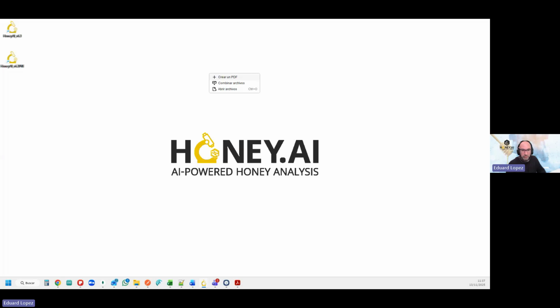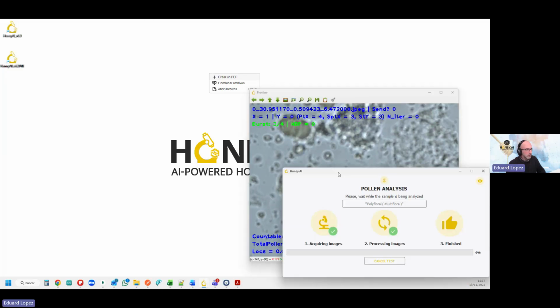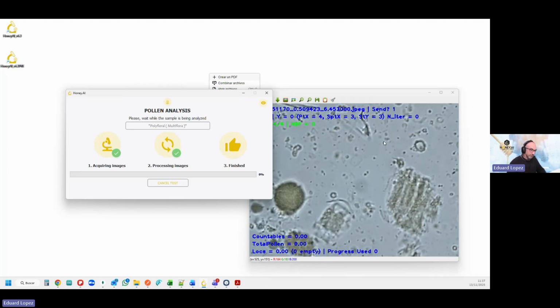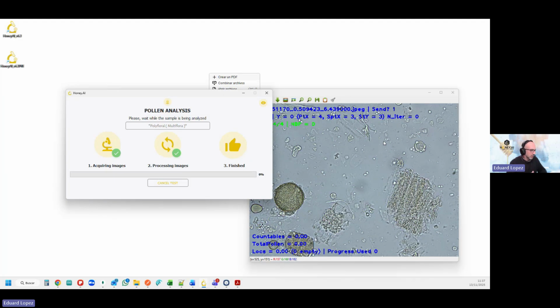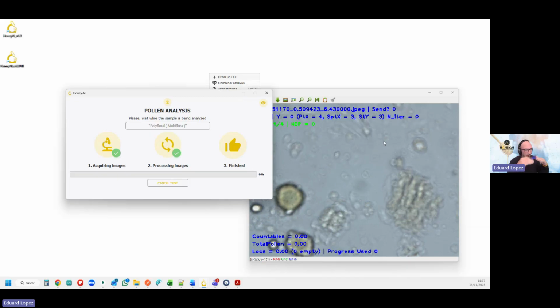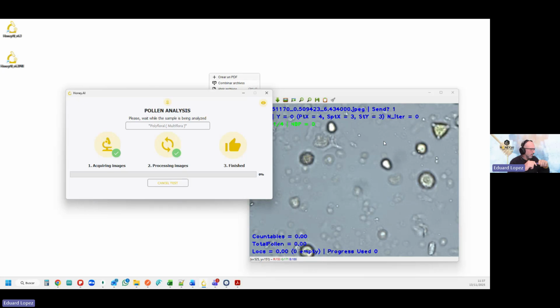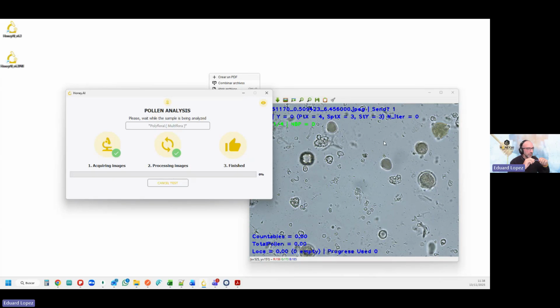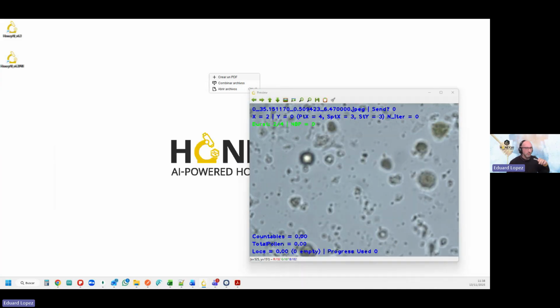And I show you now in the microscope, the application is working. Okay, it's sending now all the images. We take a lot of images for every test and send all to the server and analyze at different planes, because every pollen has the focus in different planes. For every test, we have more than 2,000 images, and we save this information in the server, and we can analyze that. Okay, and this is all.